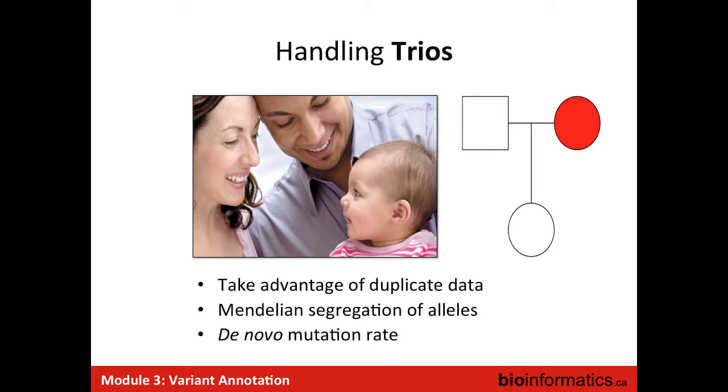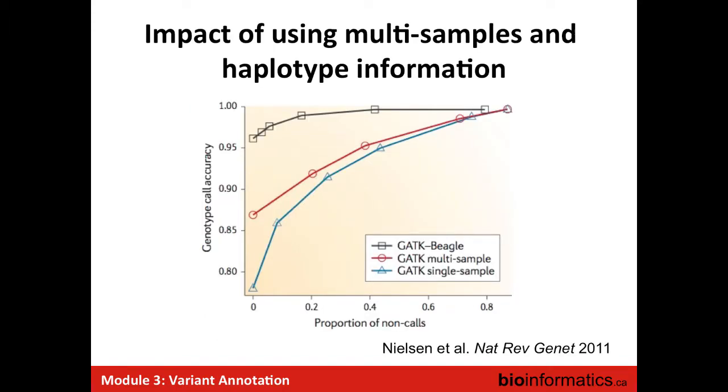One of the ways that you improve the accuracy is by getting rid of duplicates. Yes, but duplicate reads don't really change the call. It would throw off your VAF, that's right, but it's just to get cleaner data. Well, the problem is, suppose you have an error and then that error is duplicated. So you're going to think that you saw it five times and weight it too strongly. But if these are all exactly the same read, that's where it makes a difference.